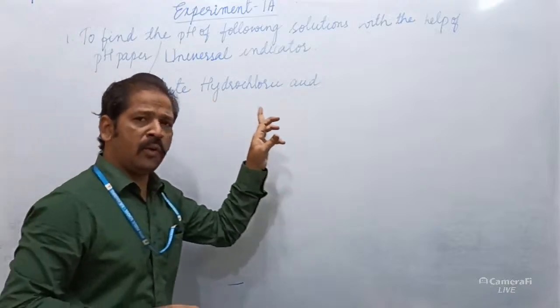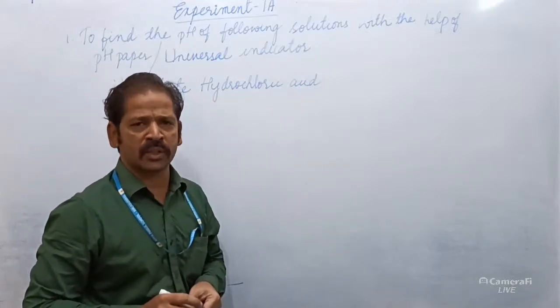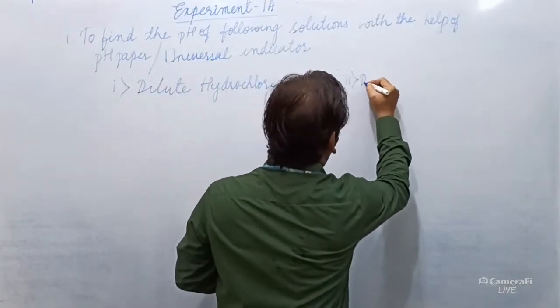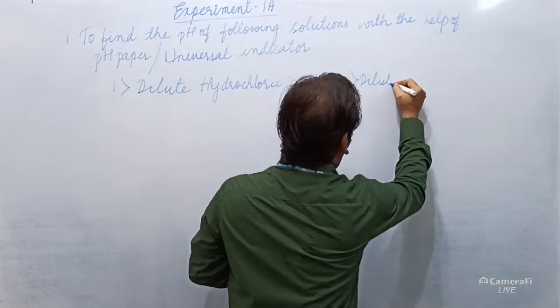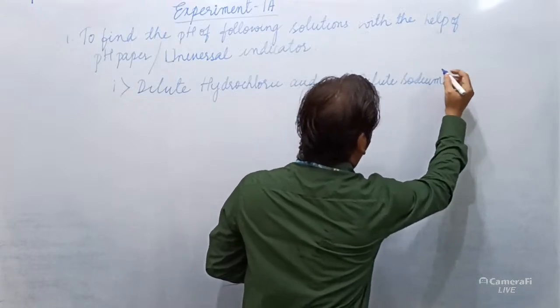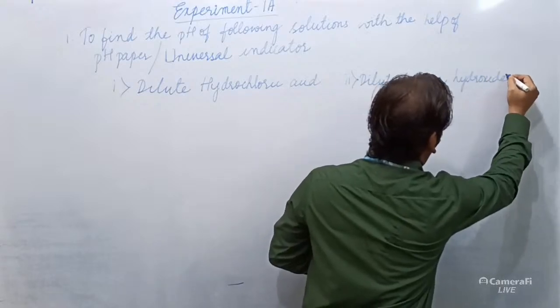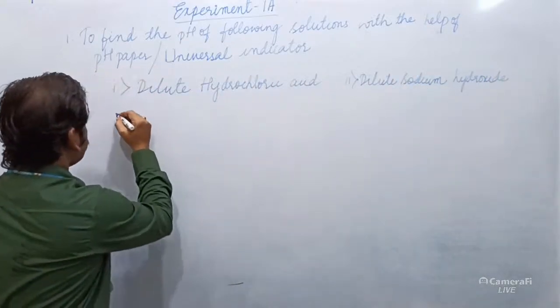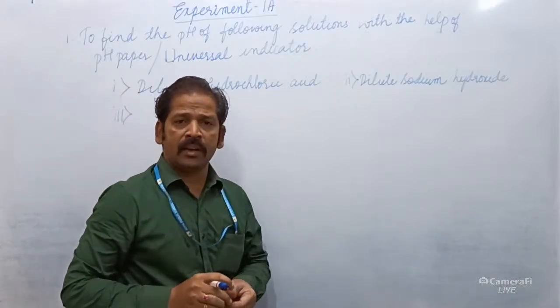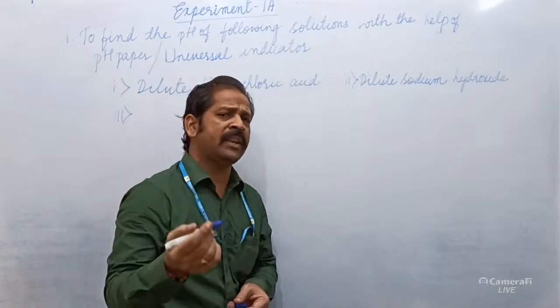The first one, dilute hydrochloric acid. The second one, dilute sodium hydroxide solution. The third chemical is acetic acid.